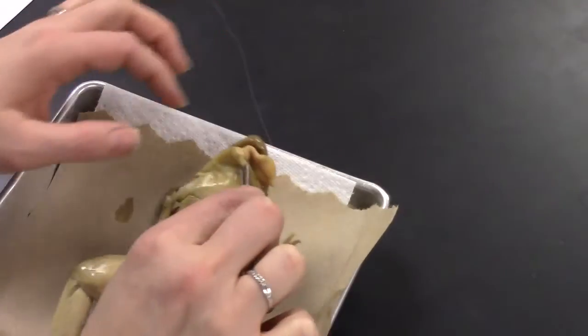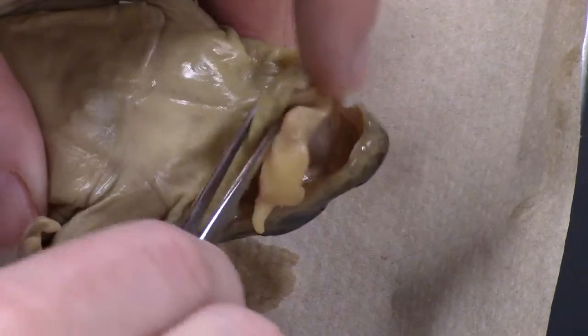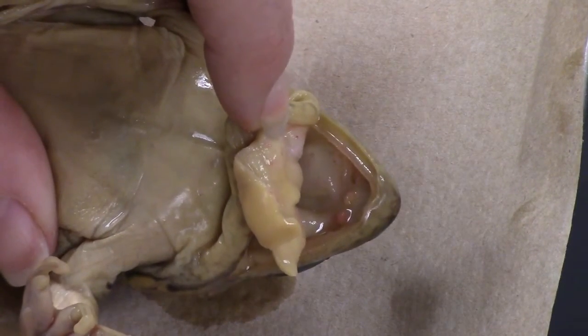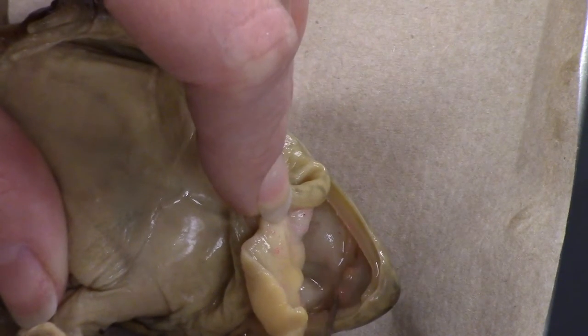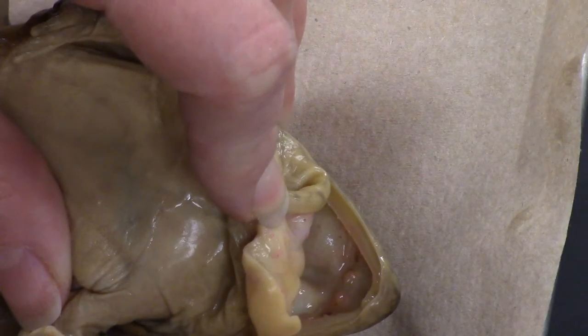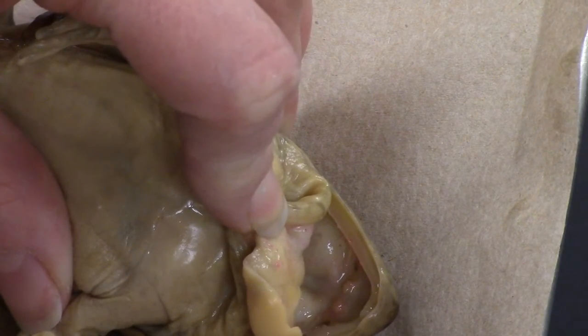A couple of things you should notice when the mouth is open. You actually have one set of teeth right here — these two little dots are the vomerine teeth. The other set of teeth is this ridge — if you run your probe along it you can actually feel them. Those are the maxillary teeth.